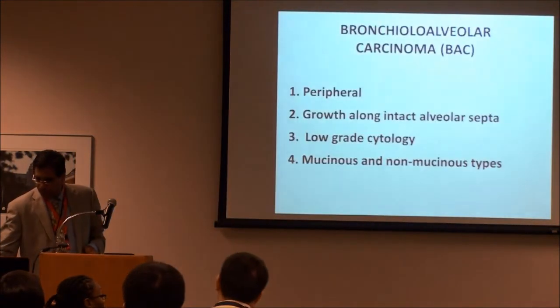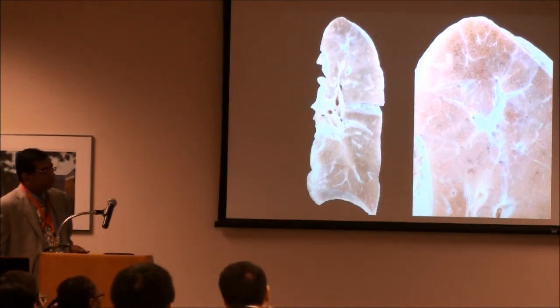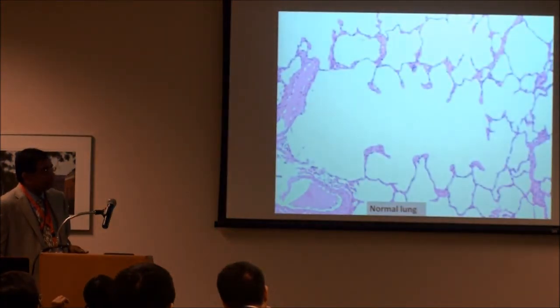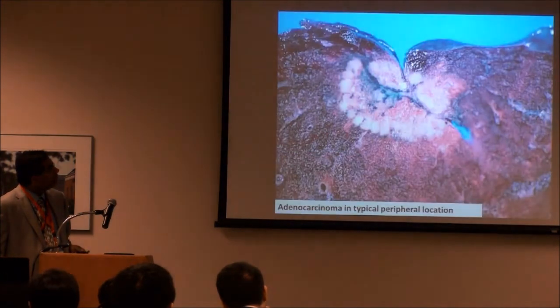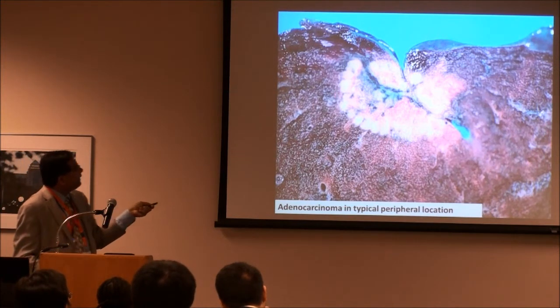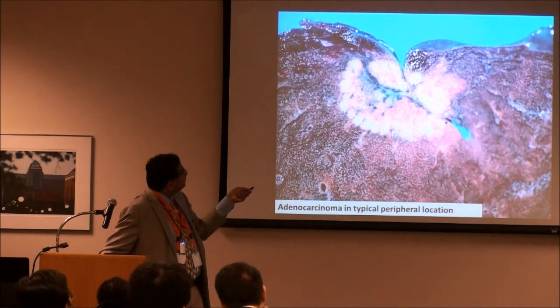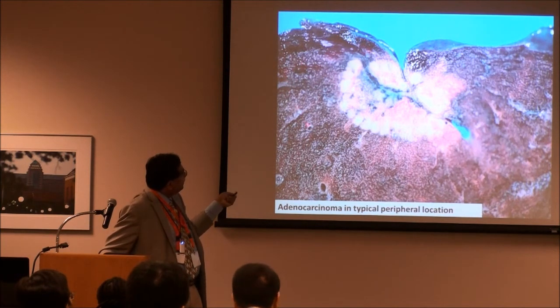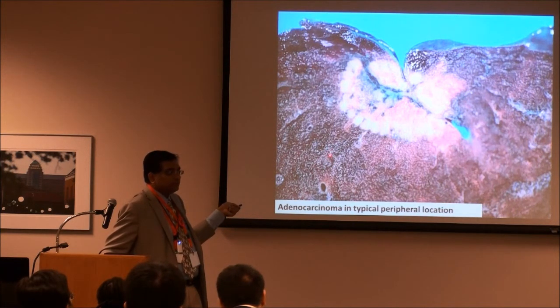Could you go back to the location of lung? The cancer lung. Yeah, this one? So is the white area cancer? Yes, the white area is cancer. So why is the other area black? Because that's how lung is. It is brown to black. That's the normal color of the lung. Everybody's lung. Okay?